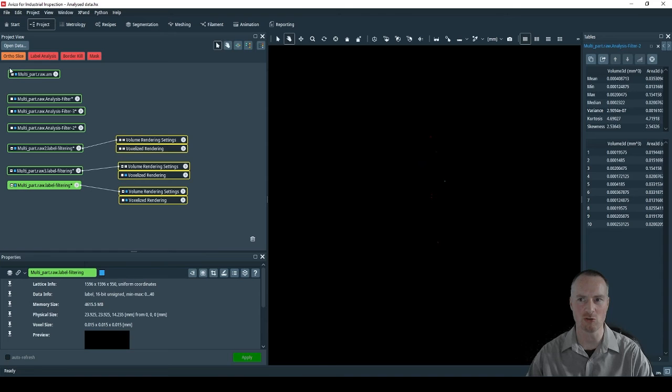Here we can see the original raw data at the top and the outputted data from the analysis. We have three parts here. We have the numerical data for component 1, 2 and 3, and then we have the labels for those pores.